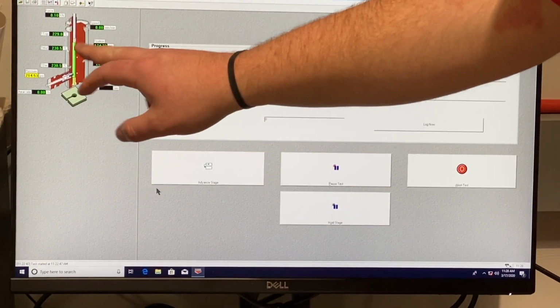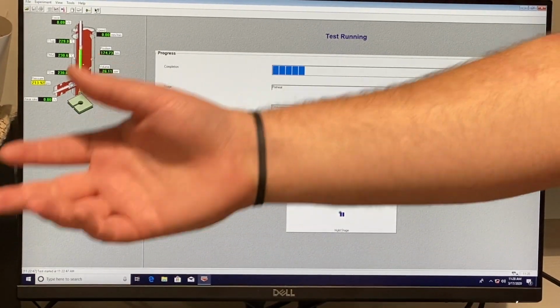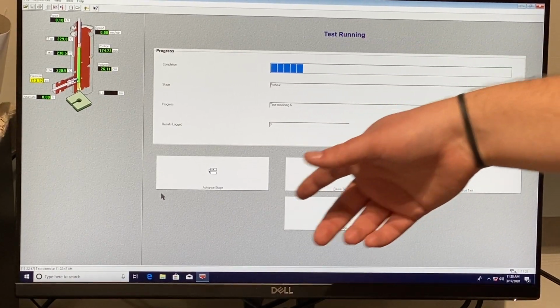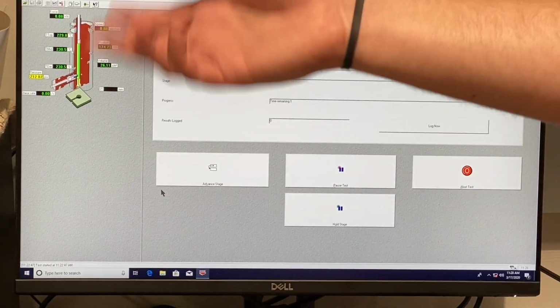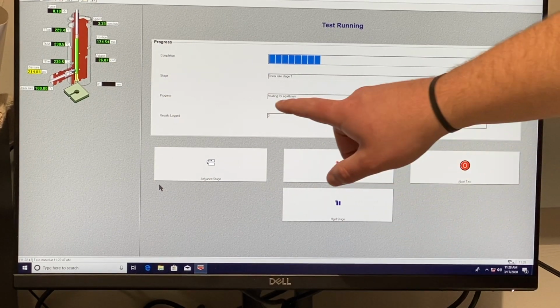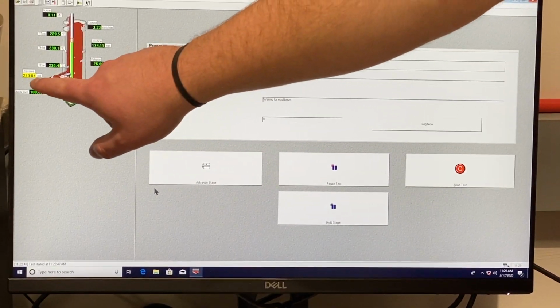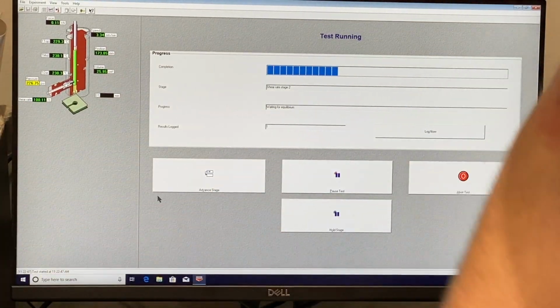It's sort of just holding the piston with a constant pressure. The pressure is sort of going down right now as material is currently leaving the barrel. But when it's done preheating, it will start its first stage at 3.33 millimeters per minute. There's really not much for us to show you of that because it is indeed incredibly slow. Oh, now it's just started its first stage. Now you can see here it says it's waiting for equilibrium. So essentially, as the speed is increasing, it's going to wait for the pressure to stop increasing.